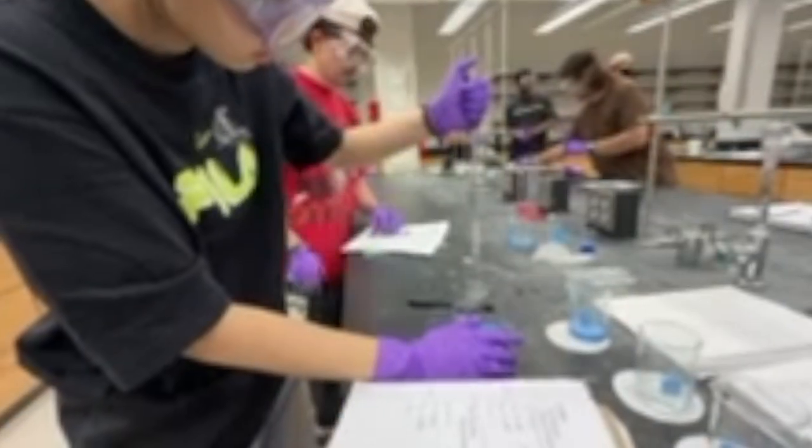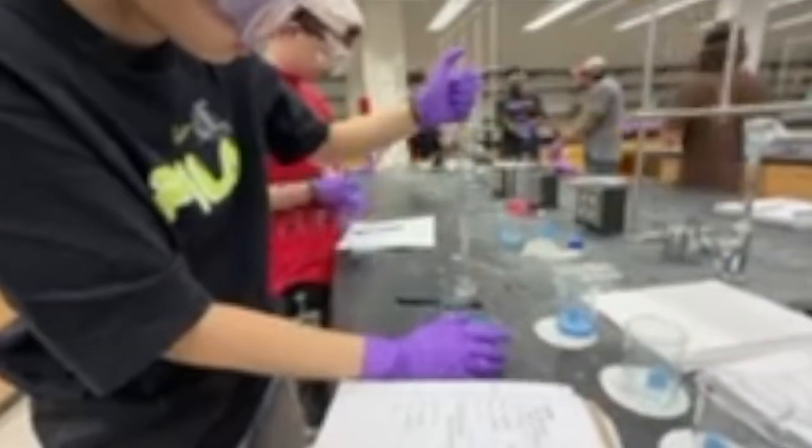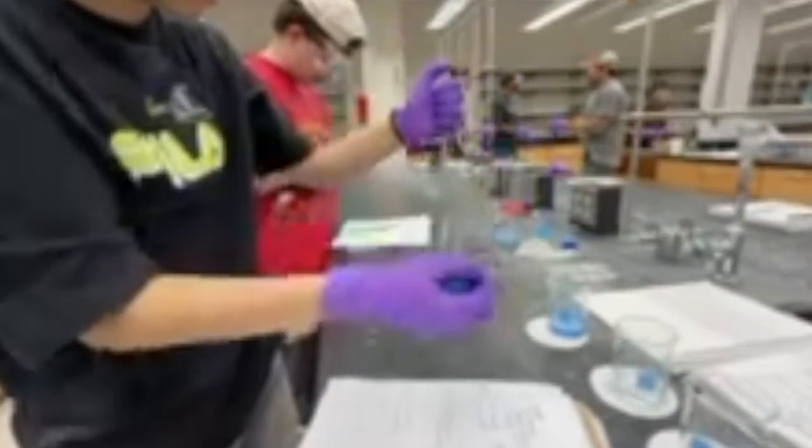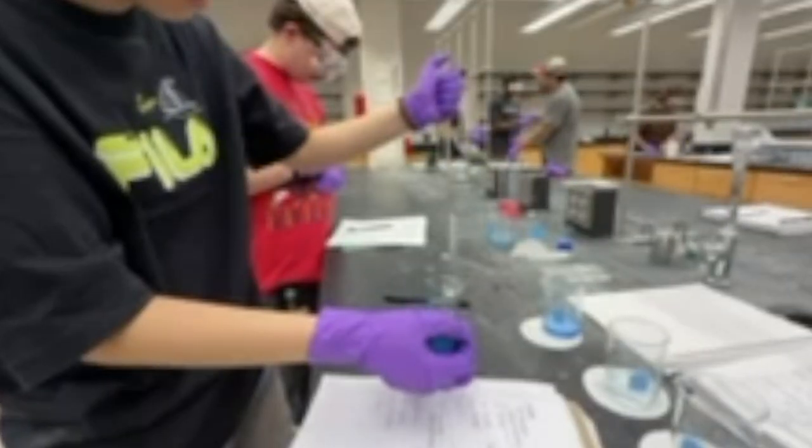Our eyes need to be level with the meniscus when we read it. If we look at it from above or below, we'll get a slightly wrong number because of parallax error. It's small things, but they actually matter for getting accurate measurements.